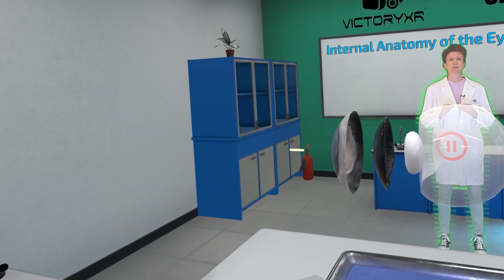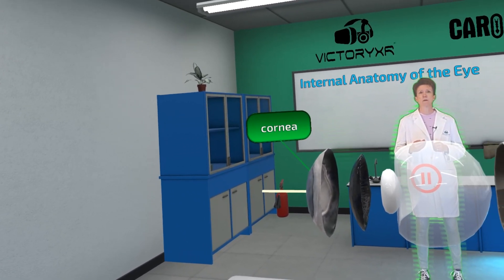Light first passes through the transparent cornea. From here, it passes through the pupil.